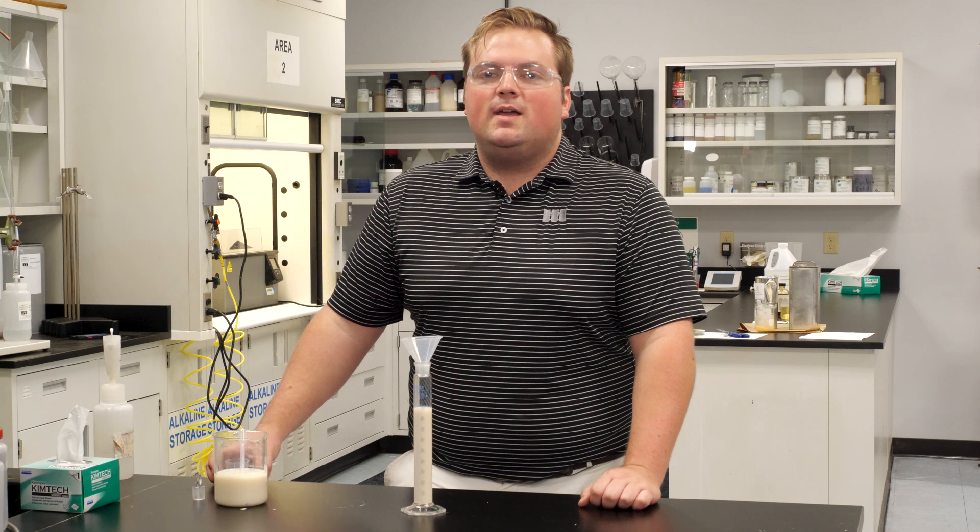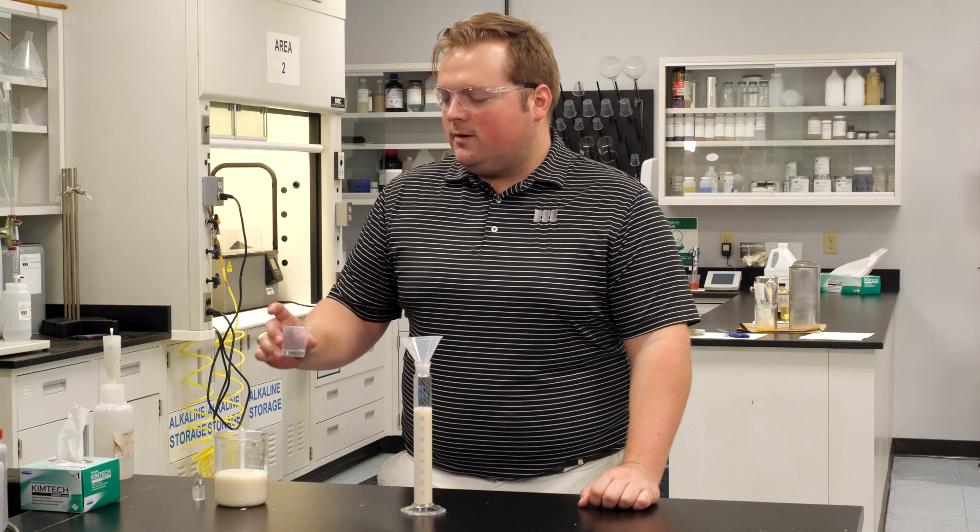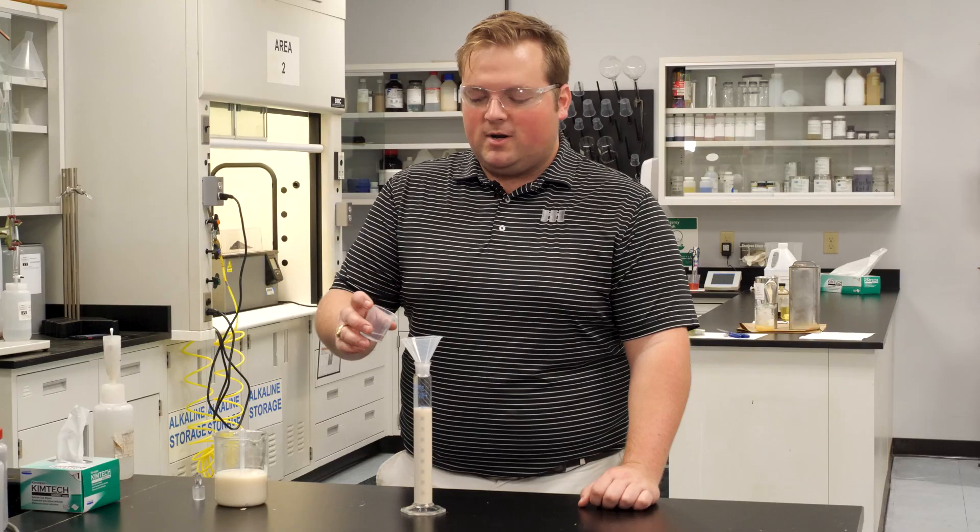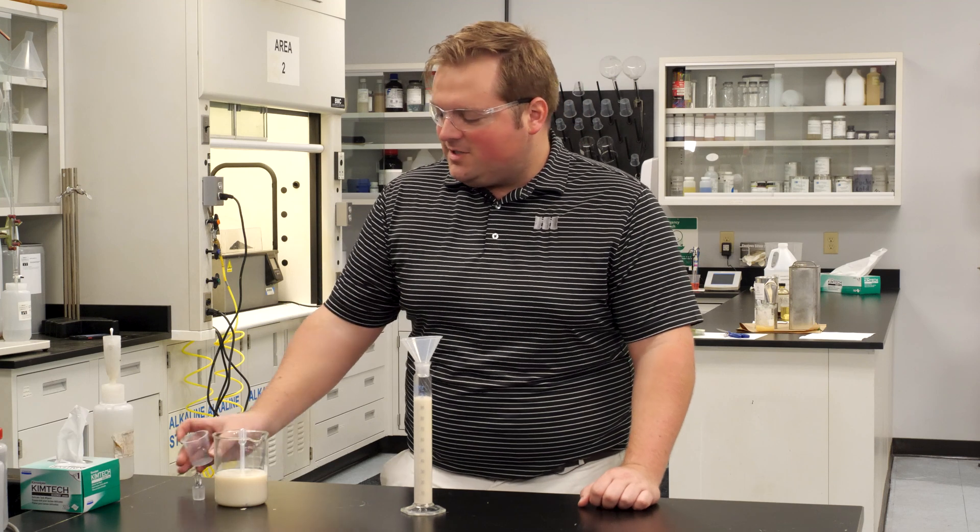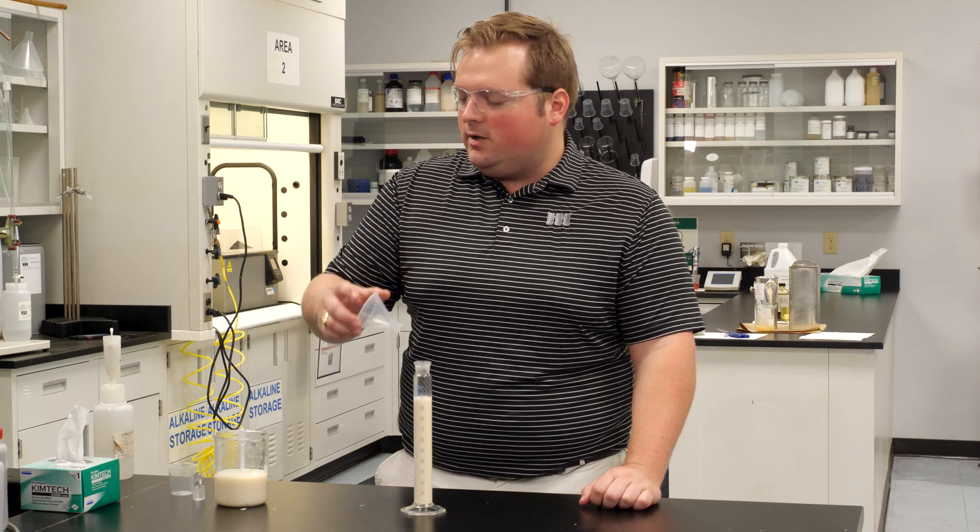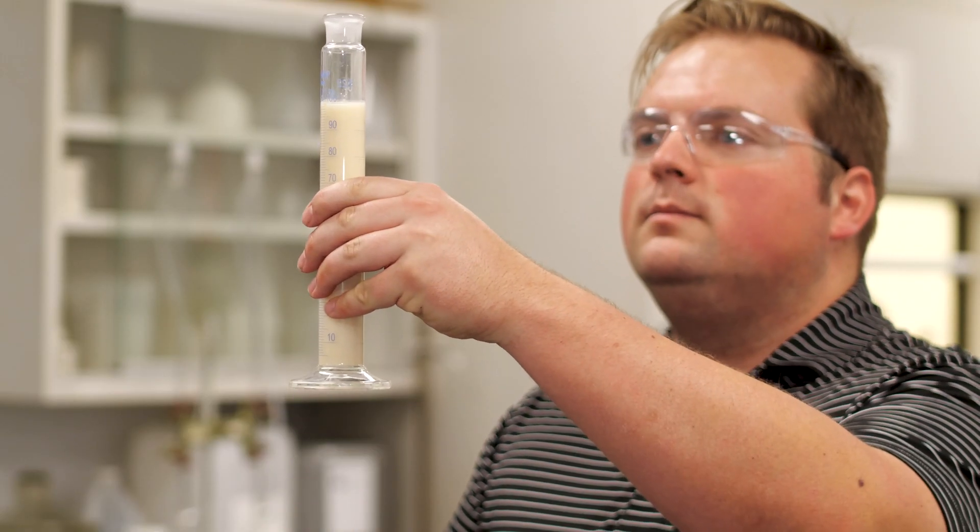Once we have the exact measurement of the solution we're testing, we're going to take 10 mils of concentrated hydrochloric acid and spike the solution. Then we'll double check to make sure our total volume is up to 100 mils, and we're good.